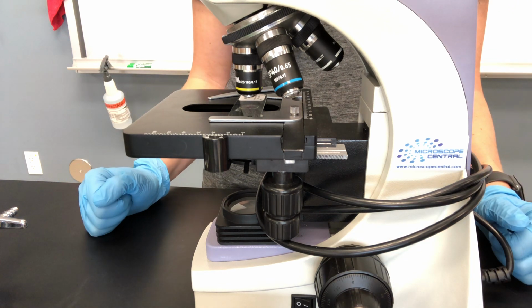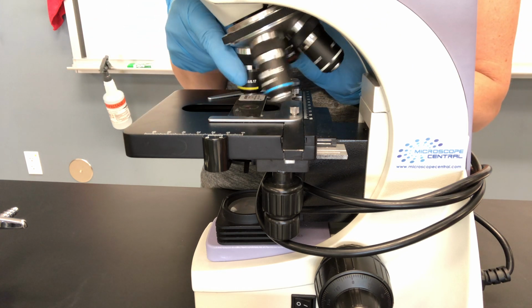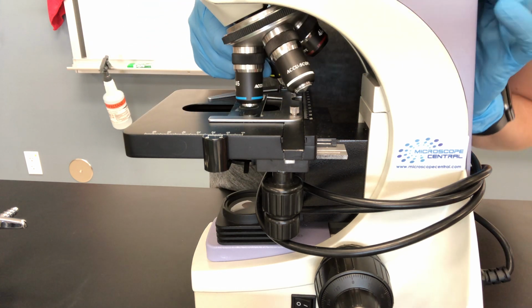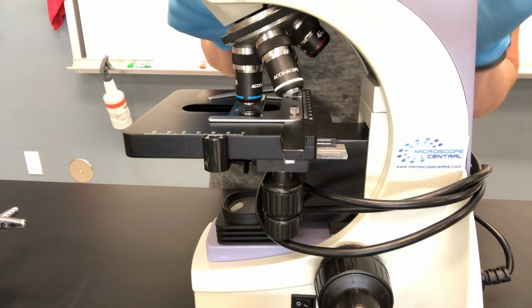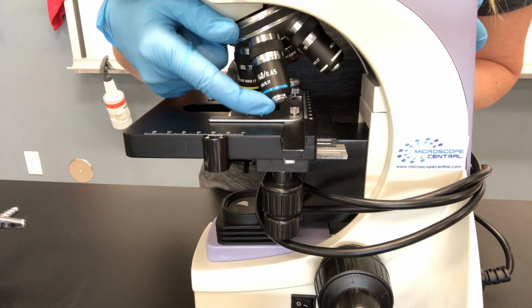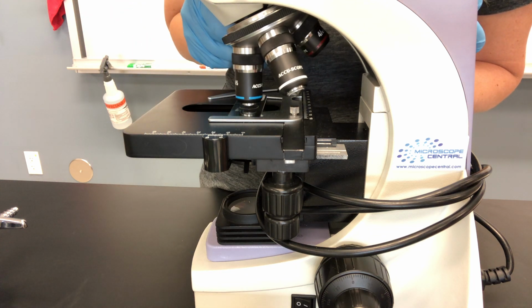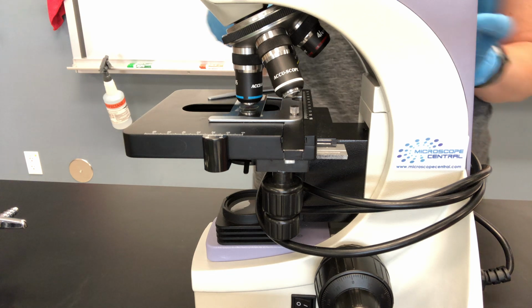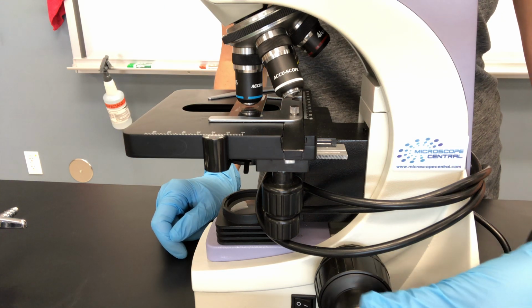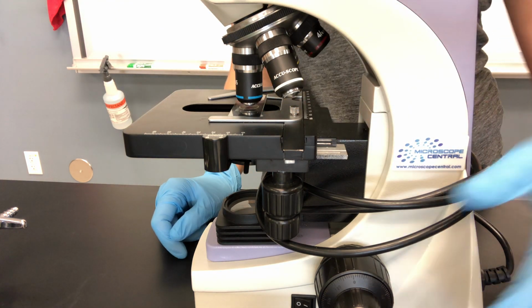You're like, okay, I want to zoom in a little bit more. That's totally fine. Again, don't touch anything, but just rotate that objective into place. And it's going to look like it's coming really close, and that's okay because these higher objectives have a little spring-loaded tip there. So then, again, just use the fine focus knob to get that into view, and you'll see how close that is. It's very, very close.